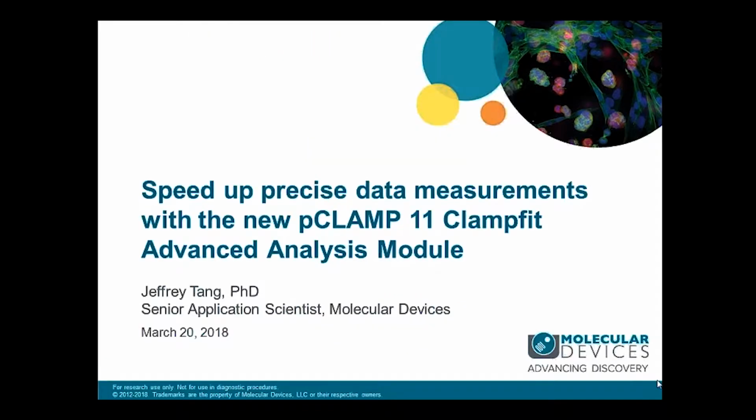Thank you, Jeff, for the introduction, and good morning to everyone on the West Coast, and good afternoon to everyone on the East Coast. As Jeff mentioned, I'm a part of the development team for pCLAMP 11. I'm proud to share the function of the new features of Clampfit 11 with you all.